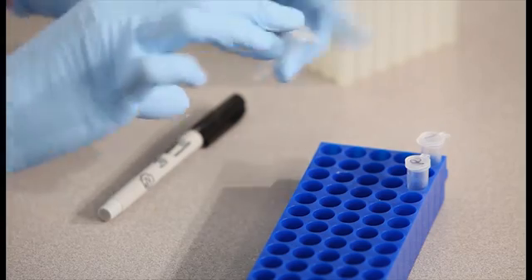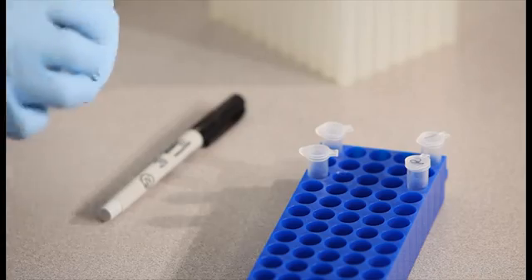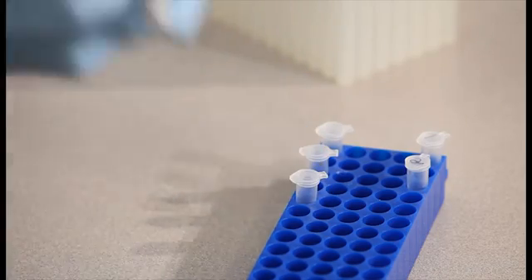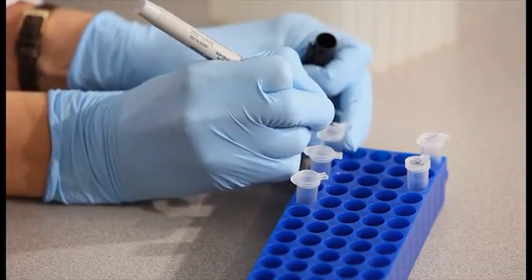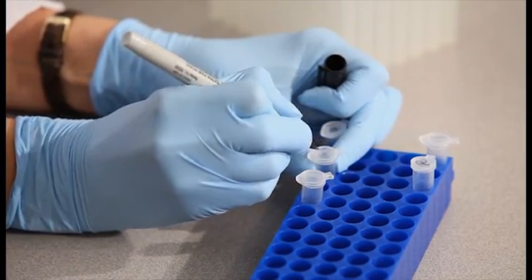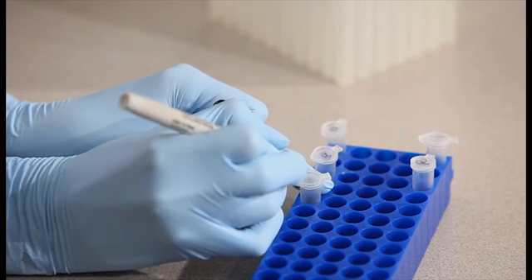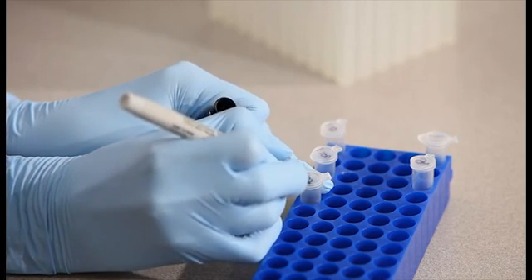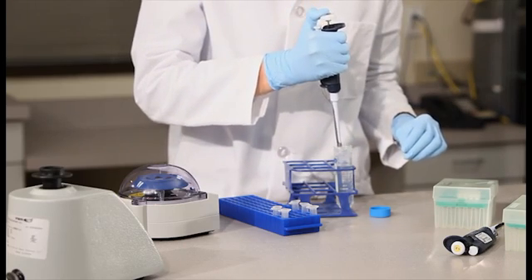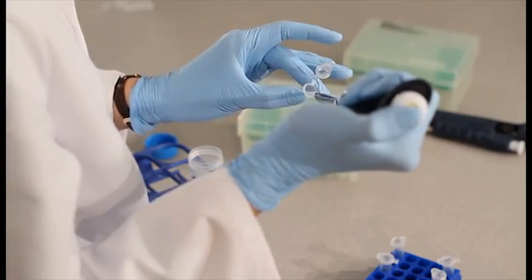The next step is to prepare a qPCR standard curve to measure the efficiency of the qPCR reaction. Prepare to make the 4-point qPCR standard curve by labeling 3 fresh microtubes 1 to 10, 1 to 100, and 1 to 1000. Then, add 90 microliters of nuclease-free molecular biology grade water to each tube.